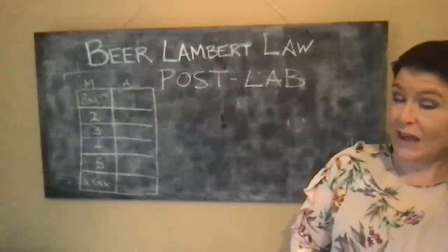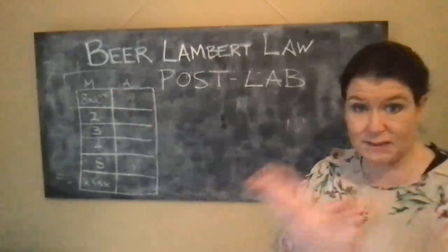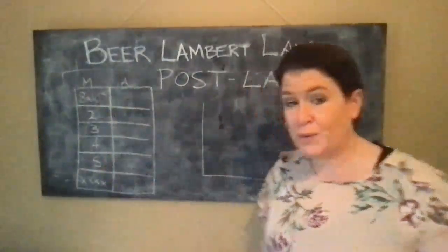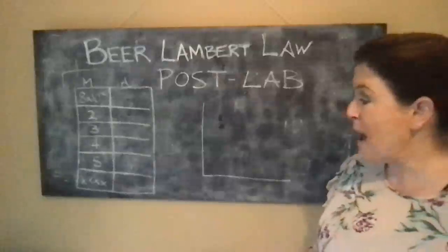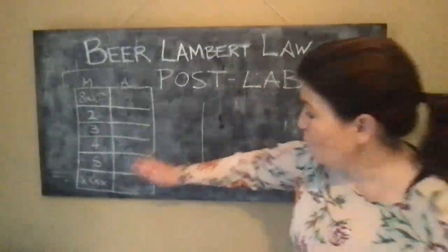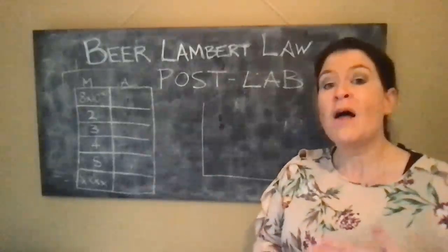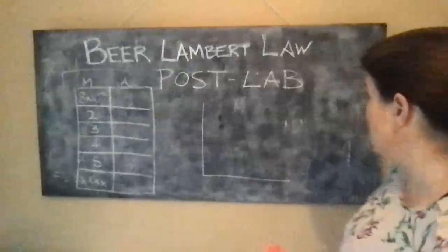And you will have seen how to do that in the stoichiometry session that we will be having in tandem with this Beer-Lambert law. And so we will create a graph. Now, we have solutions 1 to 5, which were the solutions that we made up as standard solutions using the serial dilution method. And we will also have a final value here of our unknown solution. So without using this, because remember, the first 5 are our standard solutions. They are the solutions and their corresponding absorbance values. They are the data that we are going to use to create the graph that represents the Beer-Lambert law.